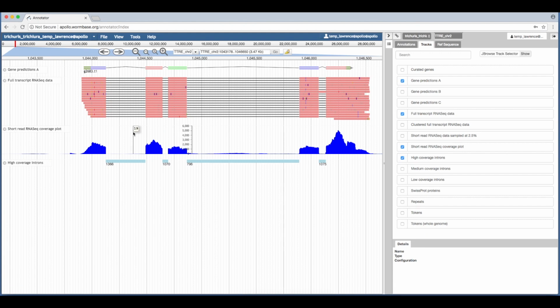So the first thing I'm going to do is look at all the different reads I've got here and determine the main difference between them. So far, the things I'm noticing is this short one down here, which I will probably ignore, and this read here, which ignores this intron. Now I'm noticing that there's high intron coverage here for it, so I'm going to leave it and forget about this read. So now the difference between the reads is the start and the stop.